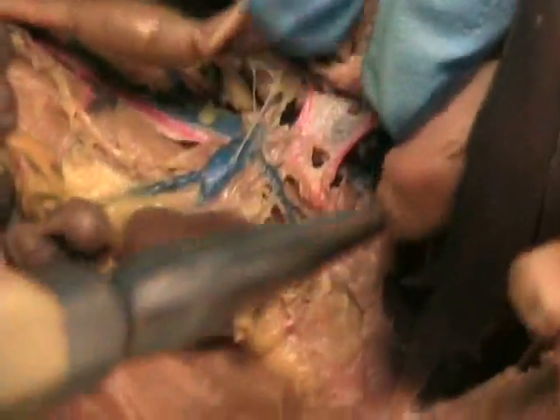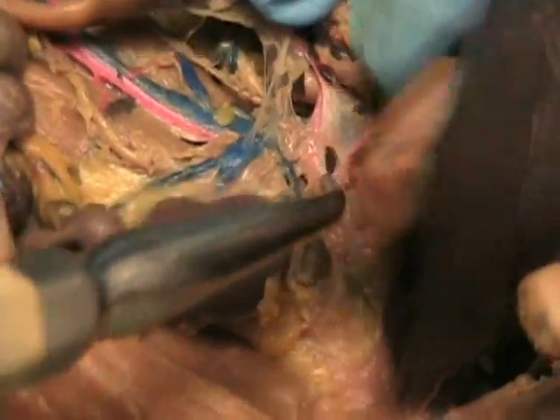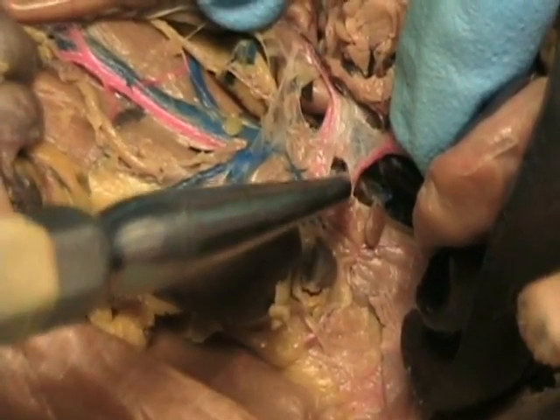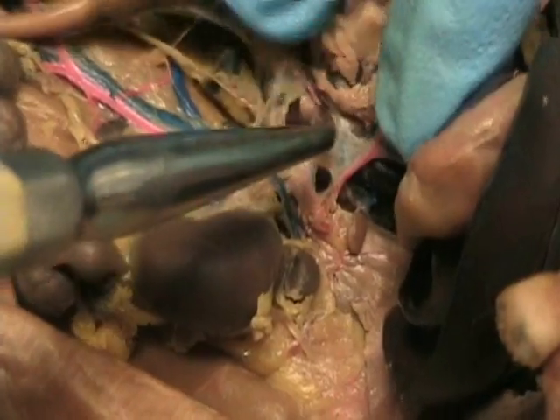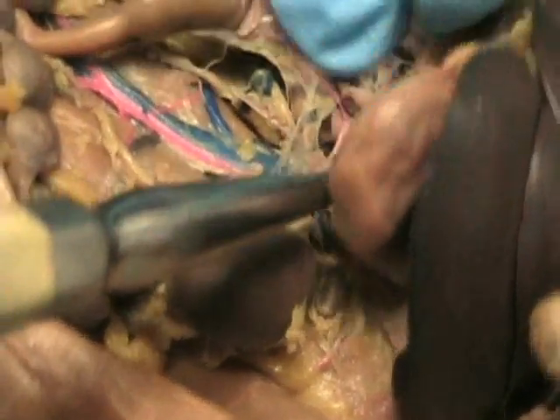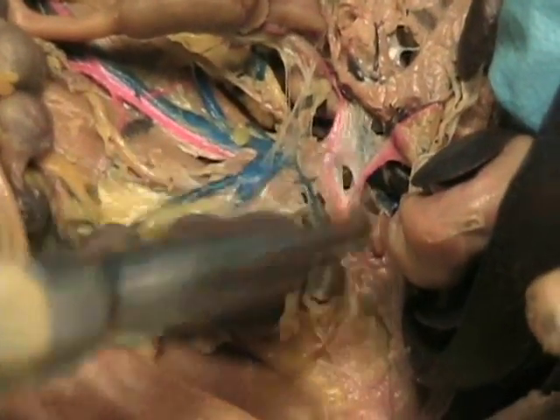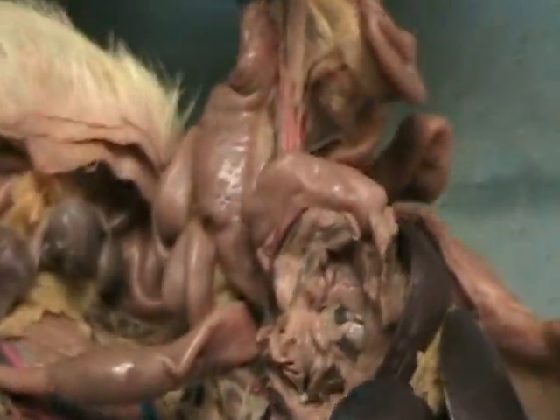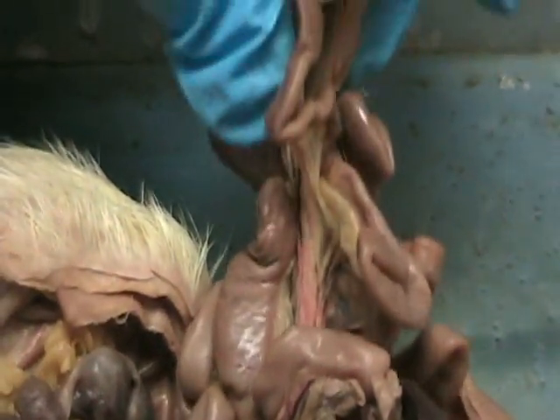But since they're not symmetrical, you're going to have something in between. So here was celiac, then in between we had the one going to the right renal, and now we have this other major one right behind, looks like right behind the celiac, because we're looking at the side of the animal. This one eventually goes up into the mesentery here. So this is called the cranial mesenteric artery, and you can kind of tell that you have the right one because when you pull on all the mesenteries, this one should be getting tugged. Okay?